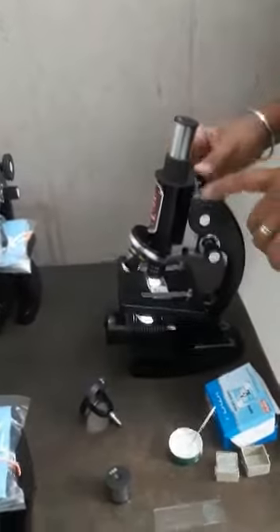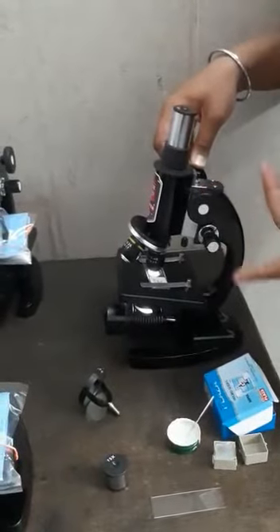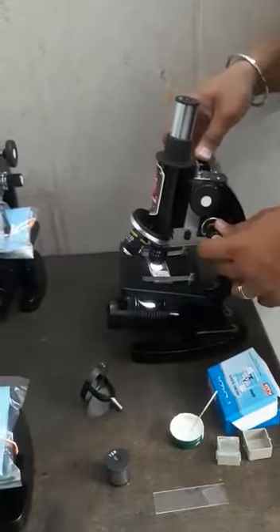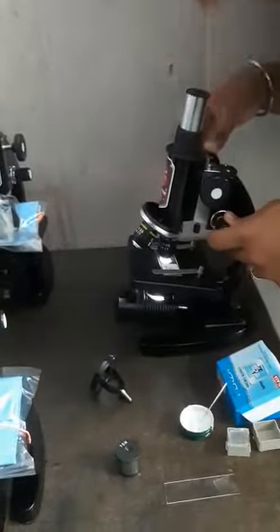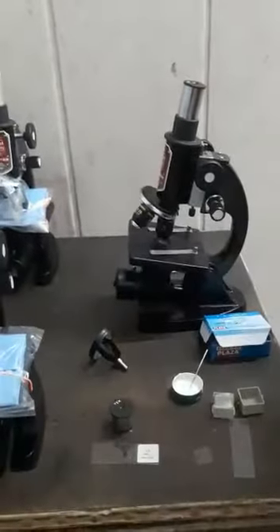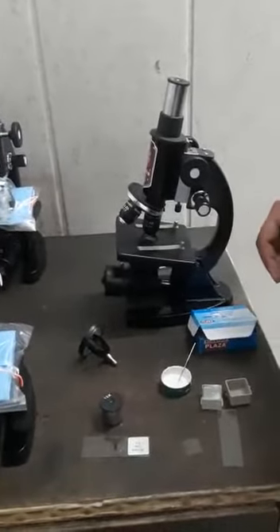I can see results with the 45x objective. Again, if you see any blurriness in the image, just use fine motion to sharpen the results. Yes, I can see the proper results here.